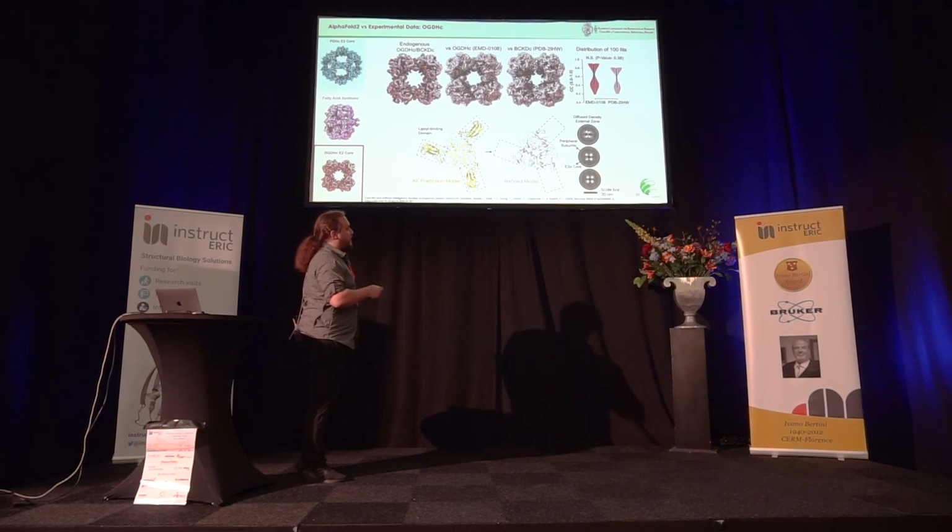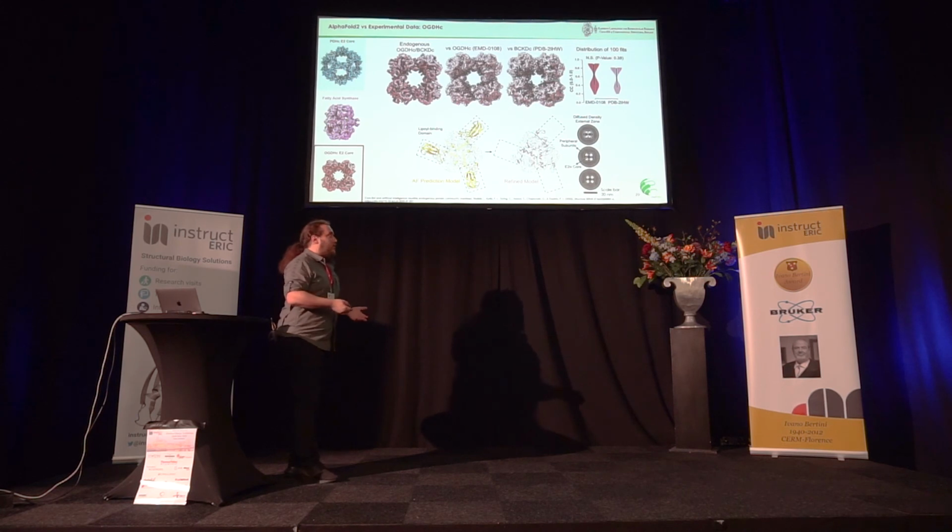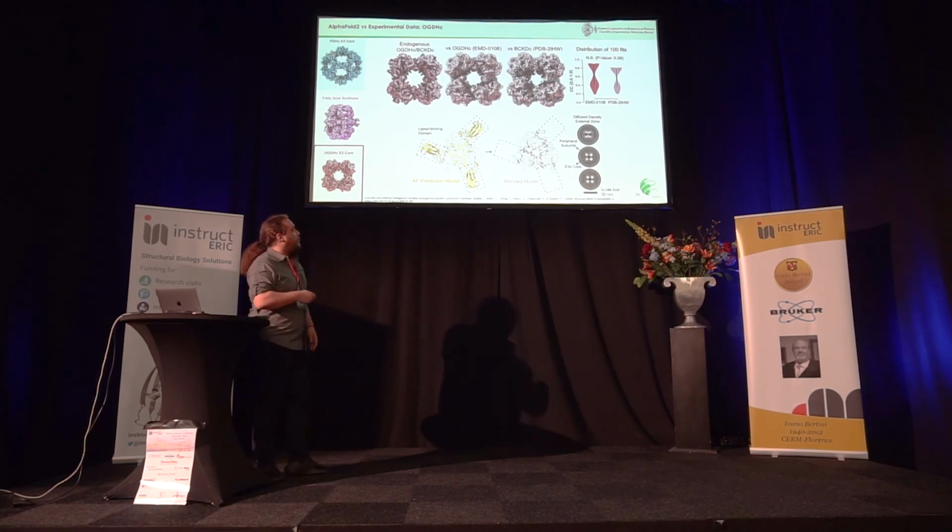Of course, the central density is very robust and stable, but we could also see a cloud of very diffuse density on the periphery, giving more value to the flexibility and high movement of these lipoyl domains on the peripheral protein subunits.